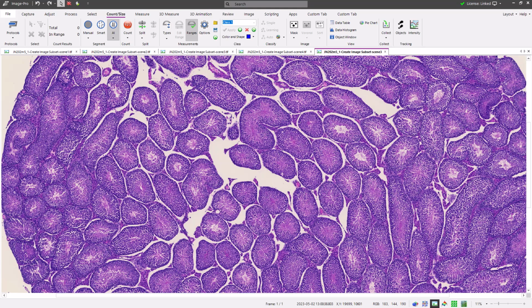If a pre-trained model does exist, test the model on your images first. If you're finding the objects of interest, the model options may be adjusted to provide a better segmentation. Once it is determined there is a need to refine the model with additional training, the model may be cloned from the AI Deep Learning Prediction panel. If no model correctly segments your objects of interest, then a new model can be created and trained.